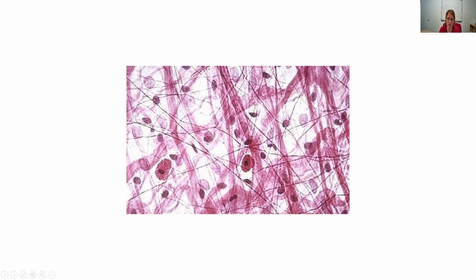This is actually more elastic fibers, but occasionally some of these may be reticular, but don't confuse that with reticular fiber because you've got all this collagen. And it just doesn't look very cohesive. Dense irregular and dense regular, you don't see this many holes in it. I see all the holes, and that's what tells me it's loose or areolar.